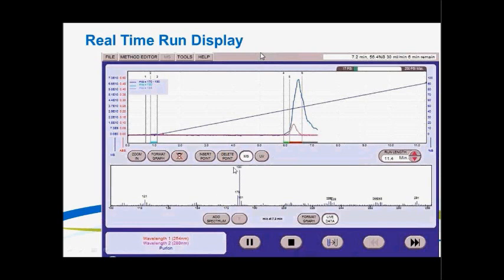And you can see that there's this solid 180 peak. In this example, the M/Z 180 that was being monitored here actually perfectly overlays with this, because this is the primary mass that's being detected. If there was another major mass other than 180 being detected here, you would see the teal line lower than the sum of the mass range that's been selected here. And the gray line, 185, is this flat line right in this region because there is no 185 being detected at this point in time.